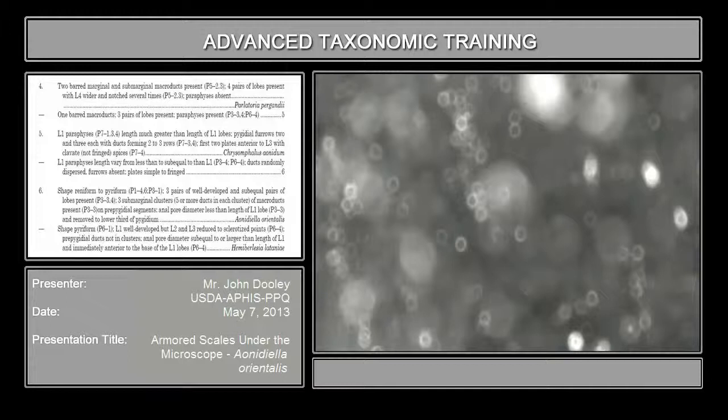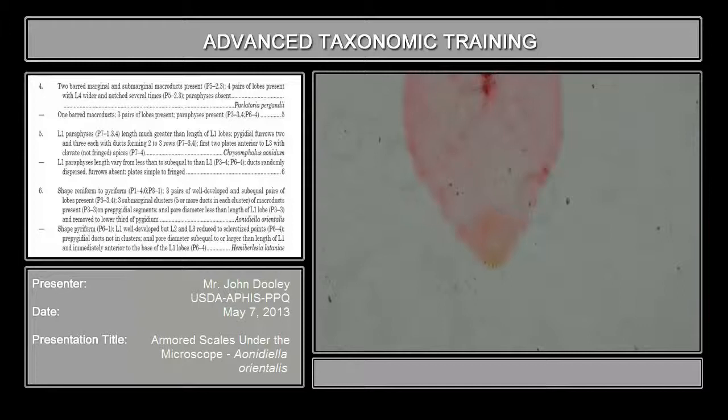A. nidiella orientalis is the next one. This is somewhat oval-shaped. What you will find on this particular genus, going down the key, shape reniform to pyriform — this is pyriform, pear-shaped.